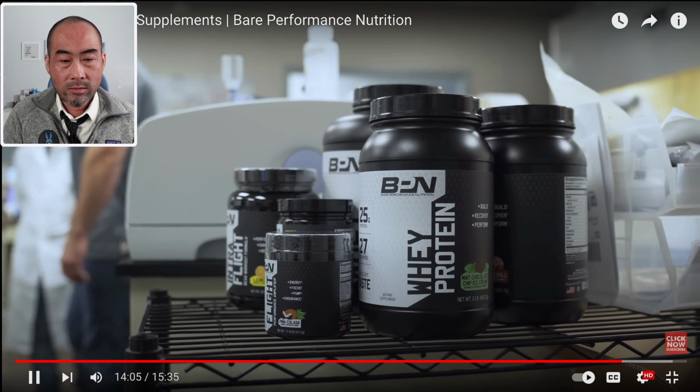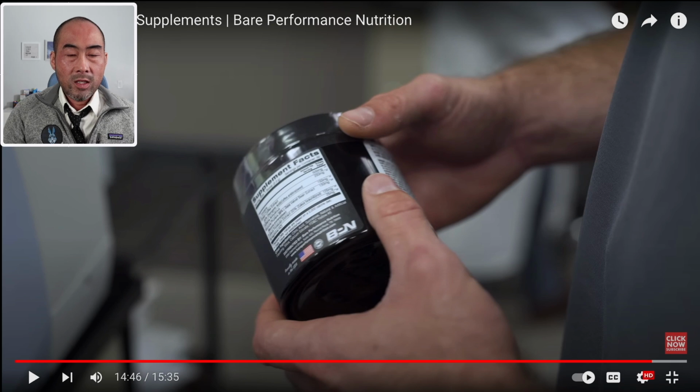When you bring a raw ingredient into this facility, for example, creatine is a white powder, and citrulline malate is a white powder. Exactly. So you want to make sure that creatine is what it says it is at that percentage. Some ingredients like huperzine and others are standardized to something, whether it's 1% huperzine or a fenugreek that's 50% saponins, anything like that. We double check that before it goes into anything. Absolutely ensure that what's in your product, you know exactly what it is, at what dosage, and how pure the ingredient is. So testing comes in before, and then testing the product again before it goes out to us before we distribute.